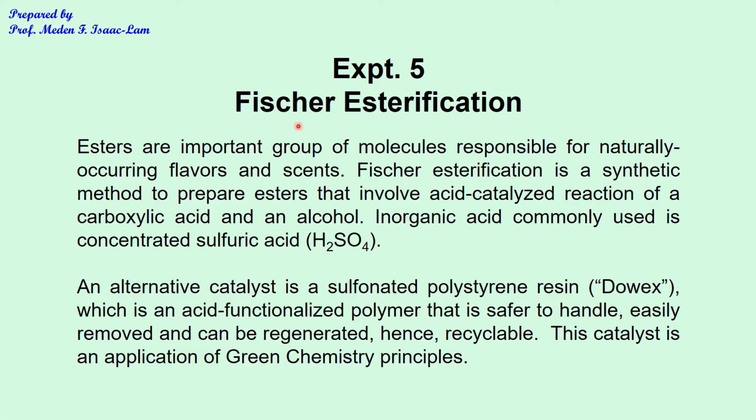Experiment 5 is about Fischer esterification. Esters are an important group of molecules responsible for naturally occurring flavors and scents. Fischer esterification is a synthetic method to prepare esters that involves an acid catalyzed reaction of a carboxylic acid and an alcohol. An inorganic acid commonly used is concentrated sulfuric acid, H2SO4.